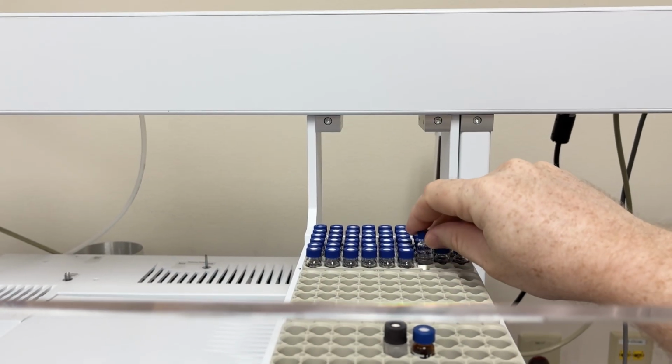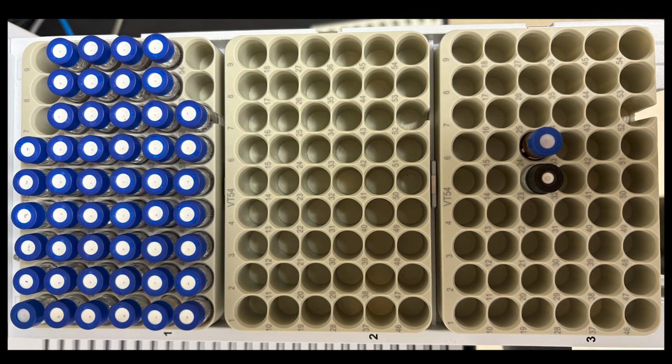Let's look at where we're putting our samples within these trays. So here we have tray 1, tray 2, and tray 3. Within those trays we specify position, so this would be tray 2, position 1. It's pretty easy to confuse spots when you're in the middle of a tray. So let's consider this spot that I've highlighted in purple right here. Take a minute and ask yourself, what tray and which position is that? Note that this vial is in tray 3, position 24, not position 25.